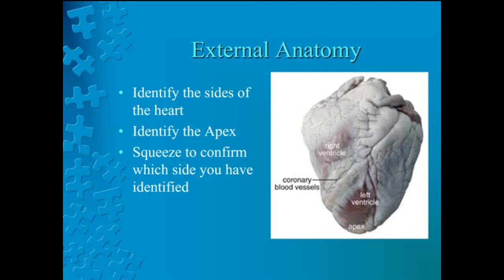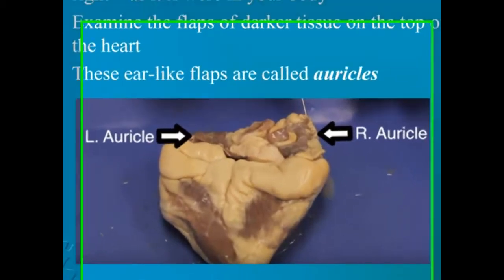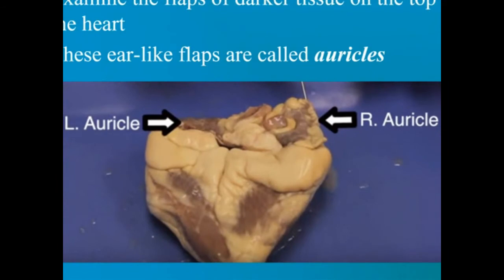Now turn the heart so that the right side is on your right, just as if it were in your body. Examine the flaps of darker tissue on the top of the heart. These ear-like flaps are called auricles. The auricles of the heart are wrinkled portions of each atrium that protrude externally to form a pouch. This structure is sometimes referred to as the atrial appendage. The auricles function as a reservoir for the atria. The term atria is plural for atrium and refers to both the right and left atrium collectively. Pause to locate the auricles.